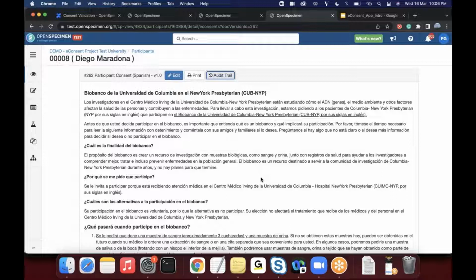So they can do the edits, and also many times data is collected over phone. Somebody didn't understand the question properly, they answered it one way, and you call them and ask them, did you really mean this, etc. So the biobank staff can do the changes, but everything is audited, so you'll be able to see who all updated the records.